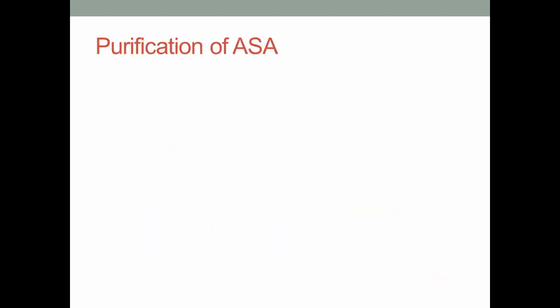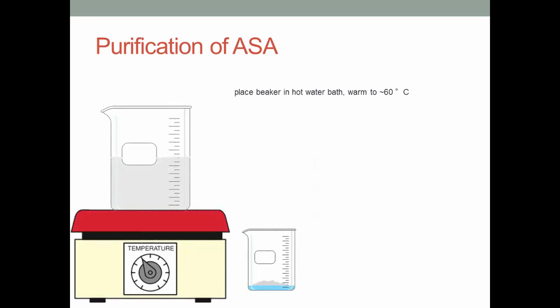Next, we will be purifying our ASA crystals. To start, add your crude crystals to 6 ml of ethanol. Then, place your beaker in a hot water bath and warm to about 60 degrees Celsius.